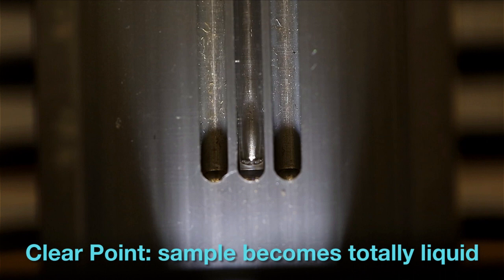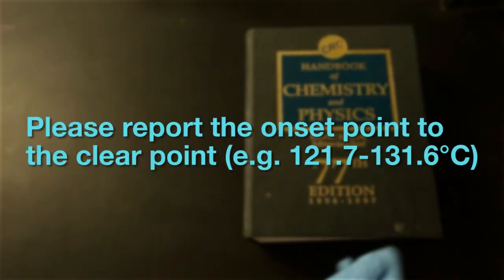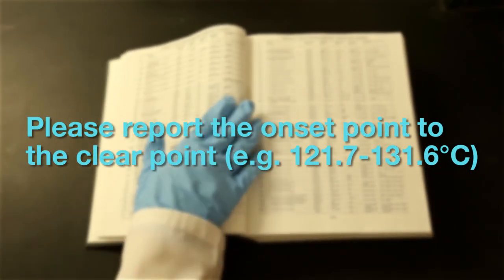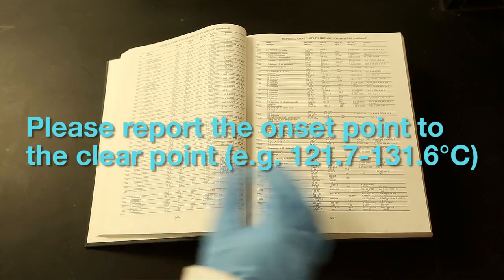The melting point is indicated by the onset and clear point values. We typically report the range from the onset point to the clear point, while some literature will report one of the three points discussed.